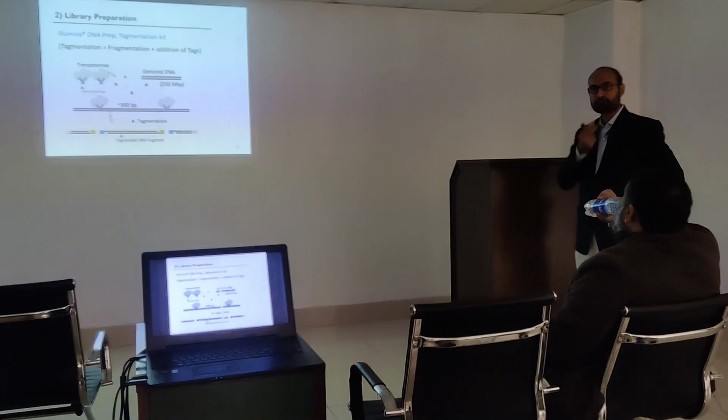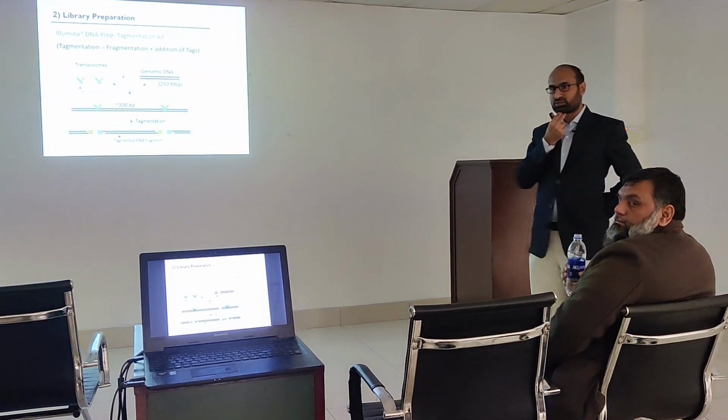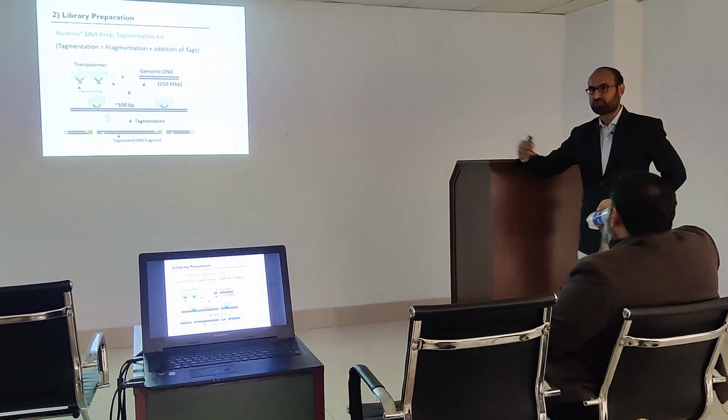Can you call these adapters indexes? Yes. Because in Illumina we use plates named indexes. So indexes are an advanced form of adapters.